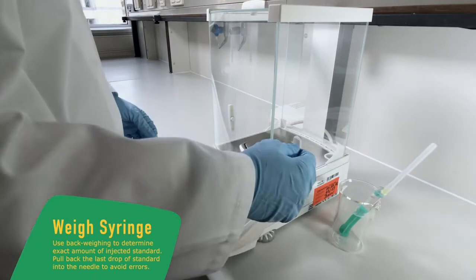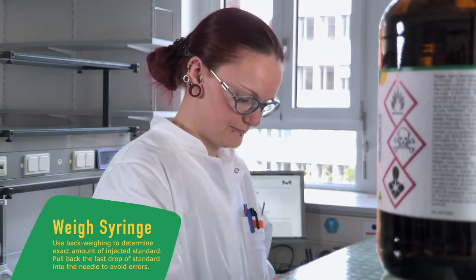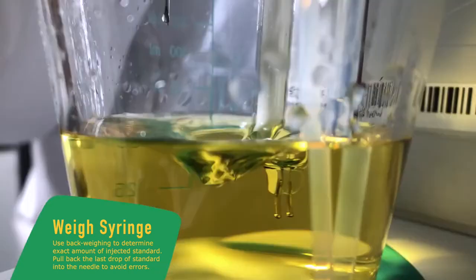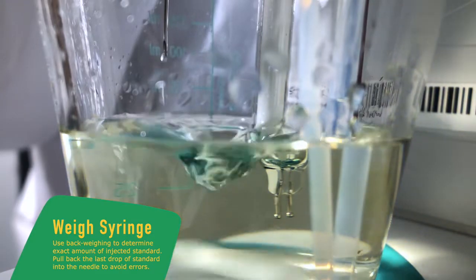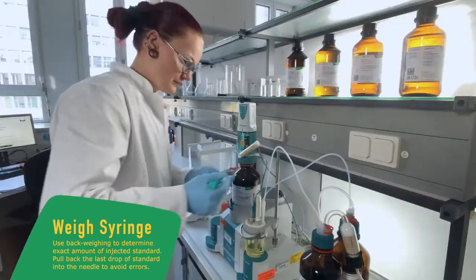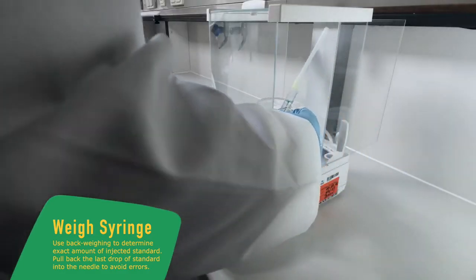And now we weigh the syringe with the water standard. Before we apply it into the titration cell, we apply about 1 milliliter of our standard into the titration cell. It is very important to pull back the last drop into the needle. And now we weigh the syringe back to see which weight we applied in our titration cell.